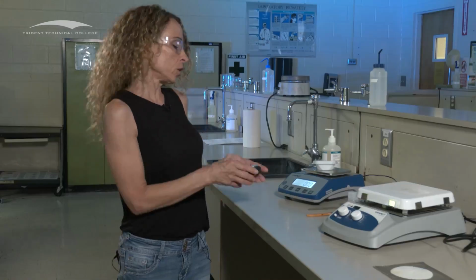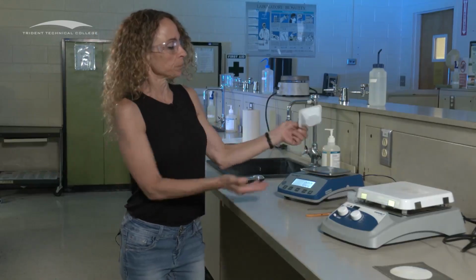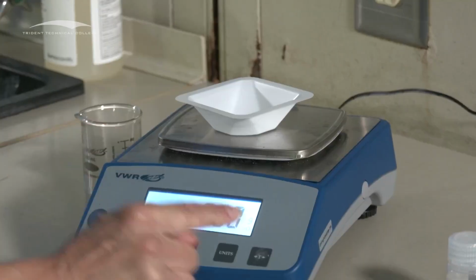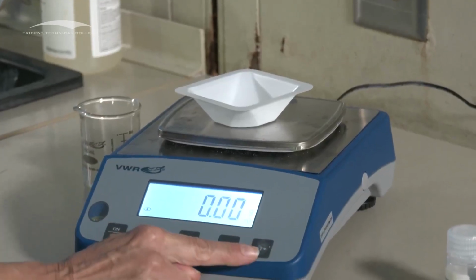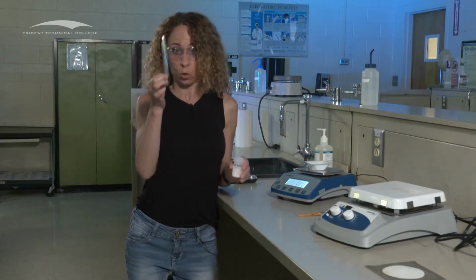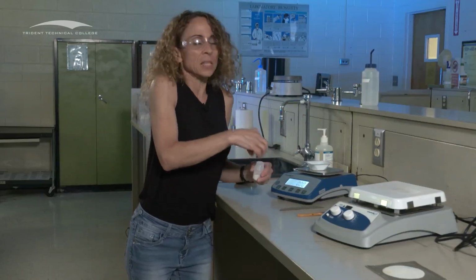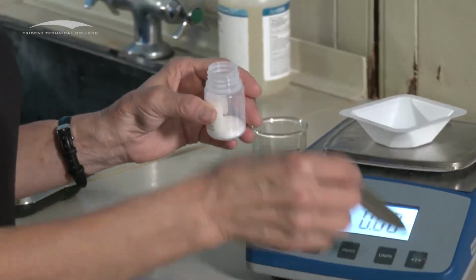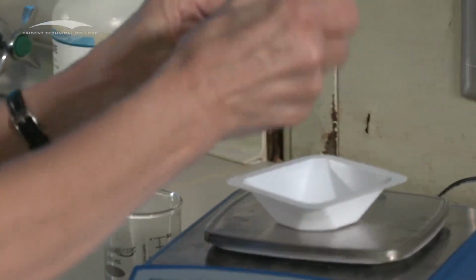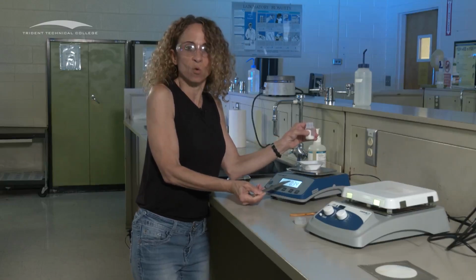So to weigh out a solid, all right, here, balance on, there's your tare. Put your weigh boat on, tare, okay, right there. Now what you're going to do here is get a spatula or a scoopula, and these labs ask for 1 gram. So what I want to show here is you're adding, and you're adding, and you're going to keep adding until obviously this says 1.00 gram.